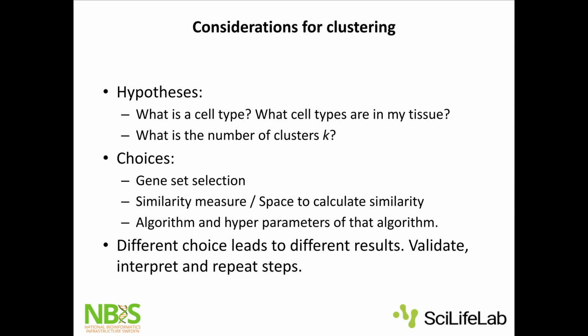Yes, I'm back to the slides that I started with. What sort of assumptions you make in the beginning will lead to different results. So be a bit lax in making too many assumptions. Also let the data guide you, see what clusters you get and explore it.